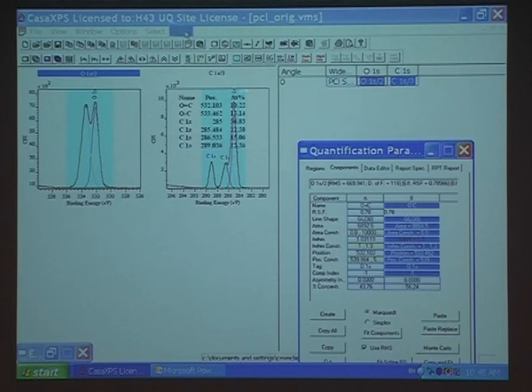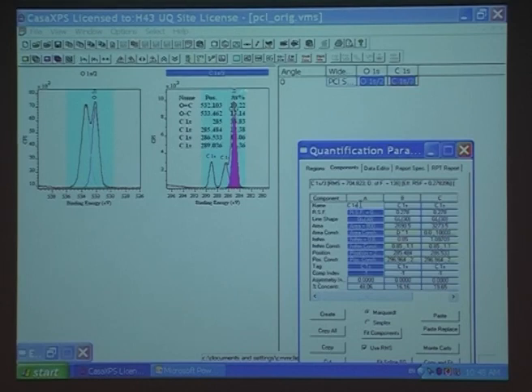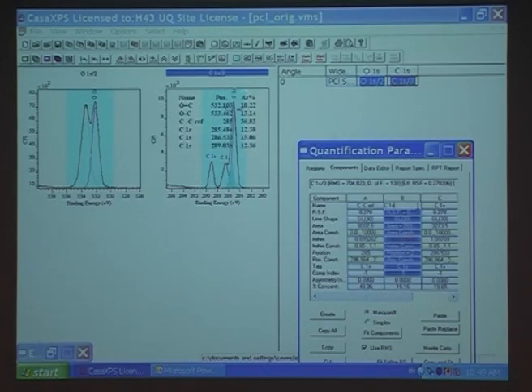Then we go to the carbon and I can start to label the carbons. This is the carbon bound to carbon in this polymer. You can see the structure. I think they give you the structure there. So this is the one, and I've used that as the reference at 285. Then I've got this carbon, which I said is the next one along. It's this carbon, the one closest to these two. That little group's having a little effect on it and shifting it by about 0.5.